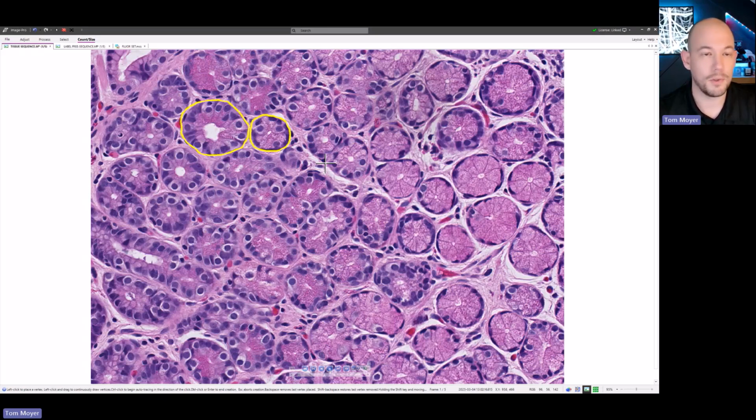One thing to mention about the manual outlining method, something that we have heard in the past from customers who were previously doing a manual method for segmentation and moved on to a different segmentation technique, is that if you are sampling just a few number of objects from each image to maybe get averages, there is the chance to introduce some sort of bias here. And this could be a subconscious bias.